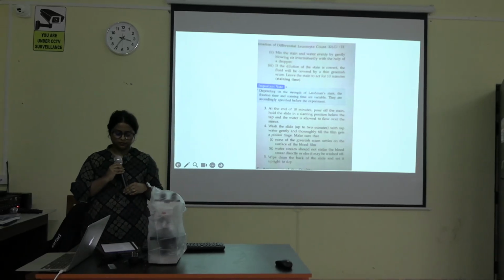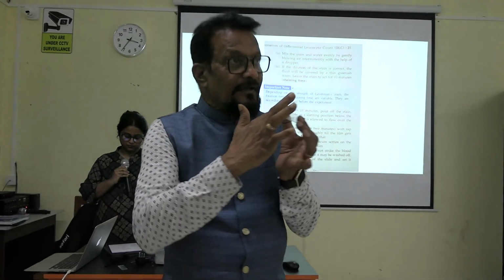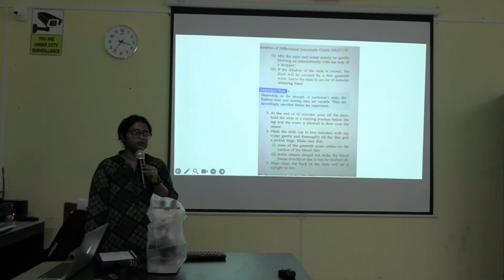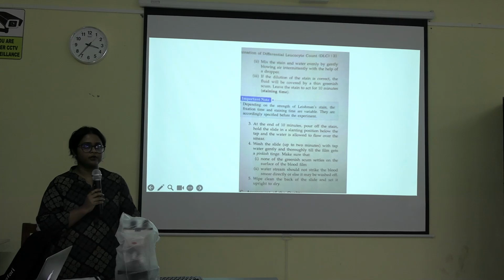At the time of washing, at the bottom, here is the film and some stain may go there. We'll keep it in air to get dried, and then we'll observe it under a microscope. So this is the procedure. Is it ready to be observed under a microscope?